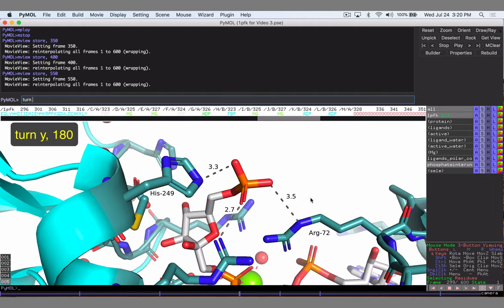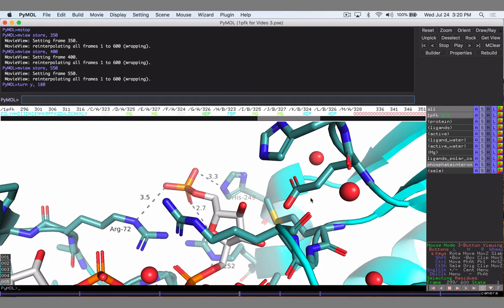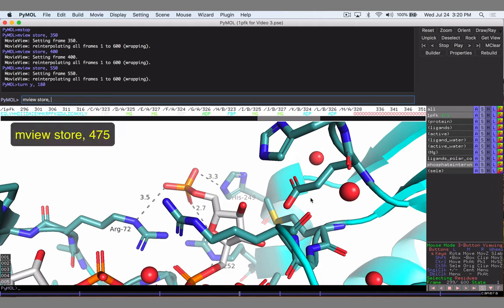Let's do our good old turn y 180 command to get exactly where we want. And again you could do this manually. You could move to wherever you wanted over the time period. You could have it spin very slowly for the first half and speed up. But I like to just have a very uniform spin. So halfway between frames 400 and 550 is going to be 475. So let's store this at 475.